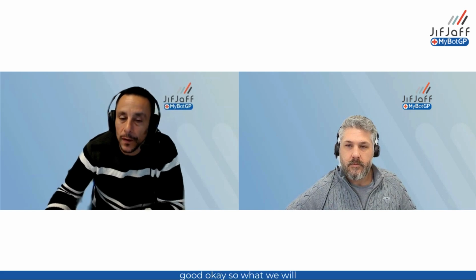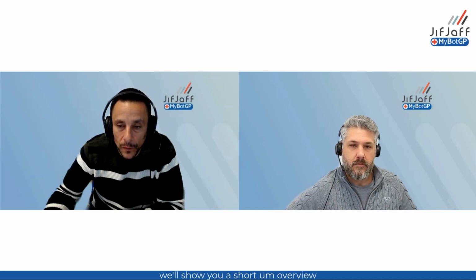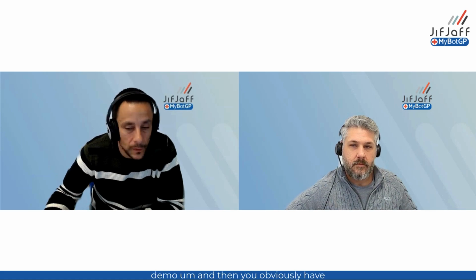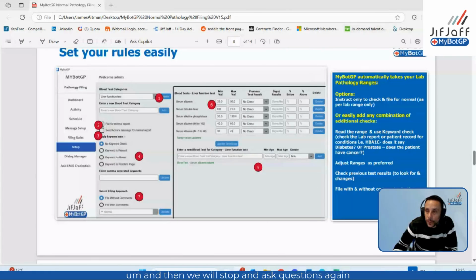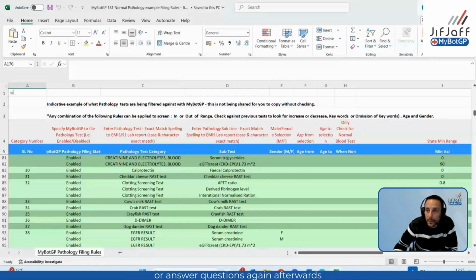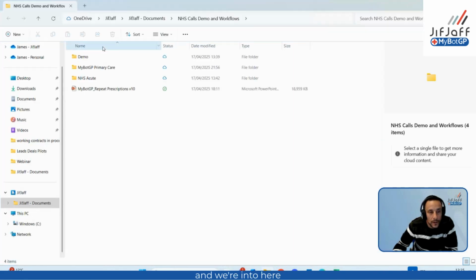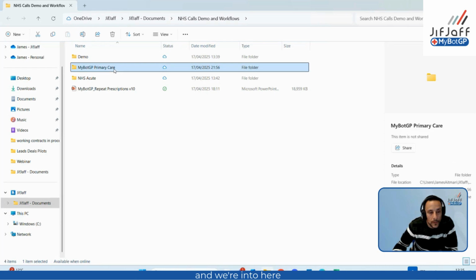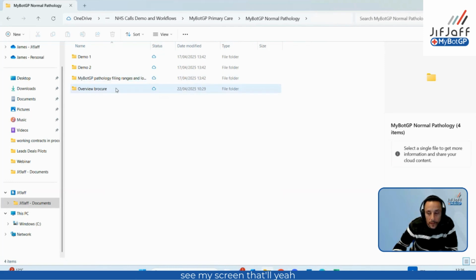Okay, good. So what we will do now is I'm going to show you a short overview video demo, and then if you have more questions, please pop them in the chat, and then we will stop and answer questions again afterwards. So if we come into here, can everyone see my screen? Yeah. Okay. Good stuff.